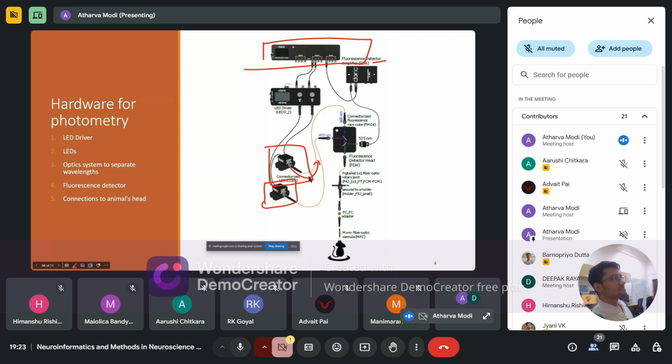This particular system in our lab, we use a custom built electronic system on just a PCB. It's an Arduino based system. This is just a data integrator. You can make it using any electronic device. You can even have a PC with a microcontroller attached to it.